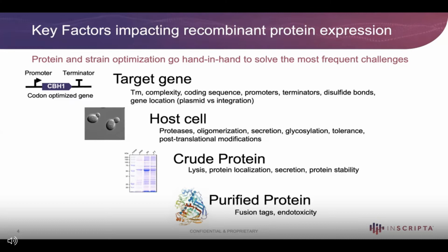And then at the end, you grow up your host cell in some type of media. So you're thinking about the media, and you're thinking in terms of how to get that purification. You might want to introduce fusion tags into it. You're probably looking for a very specific amount of the protein of interest, looking specifically at what confounding factors are there, such as endotoxin levels. Can you secrete the protein rather than having it internal to the cell and avoid lysis, etc.